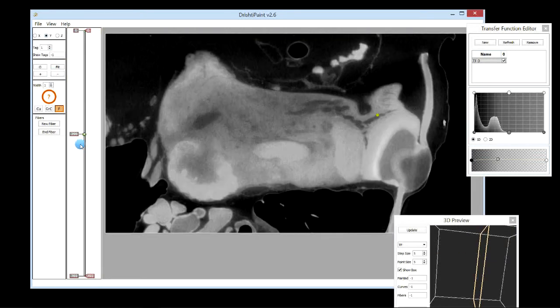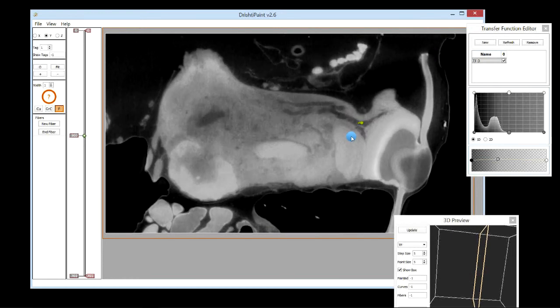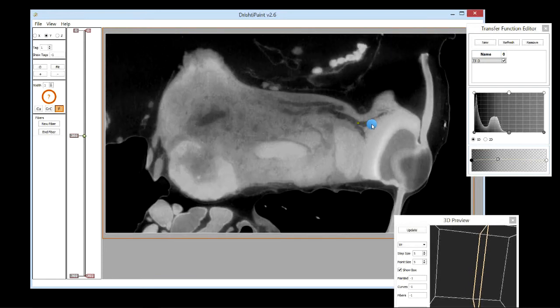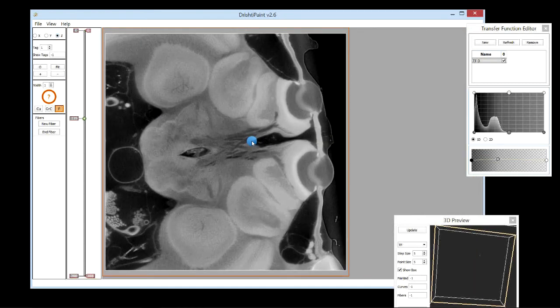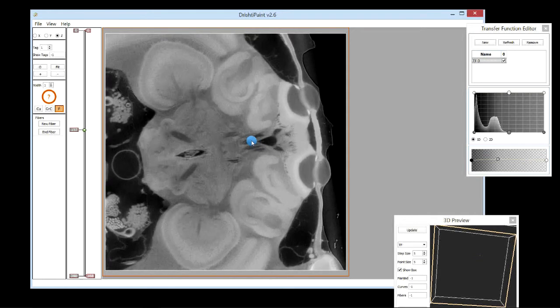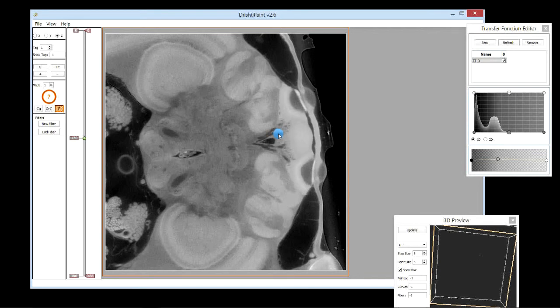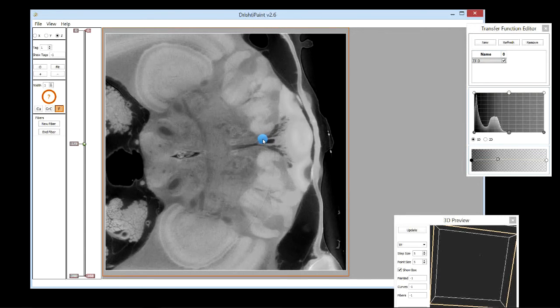Or we can go into another view here. Yes. Okay, and then Z here. Okay. So this is the fiber here. So we can keep on adding. We can add intermediate points, and these will be automatically interpolated. So this possibly goes here, and then possibly here.